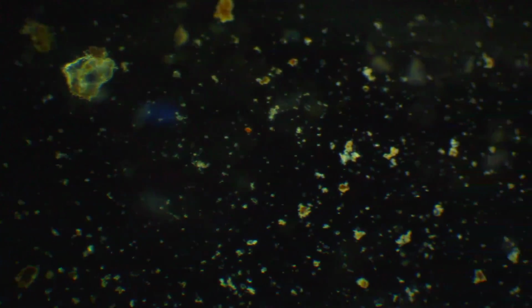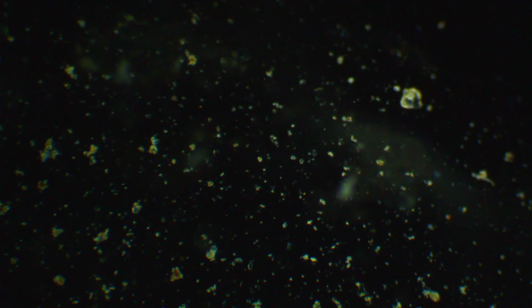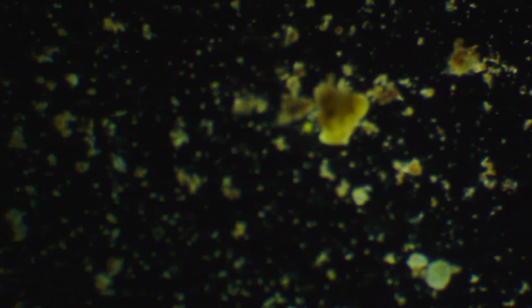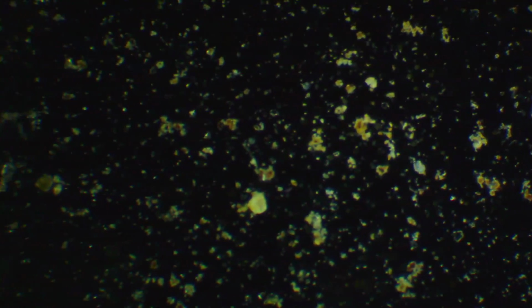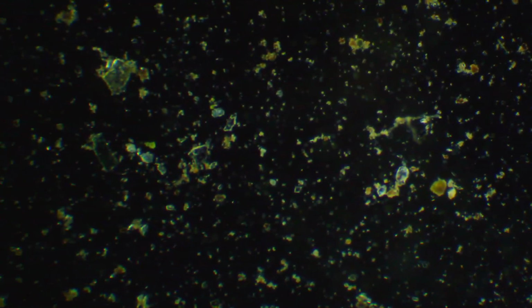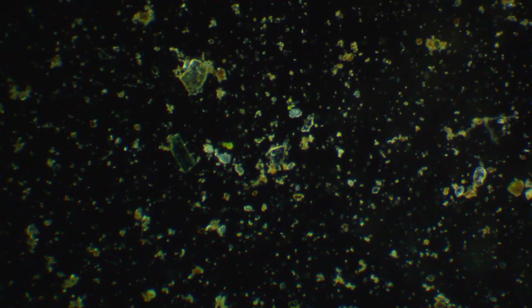Focus. Focusing is a constant thing. I'm trying to move the stage and focus at the same time, with one hand, actually. Focus there. Not much interesting. Oh, is that a dead thing or is that sand? Nope, that's sand.